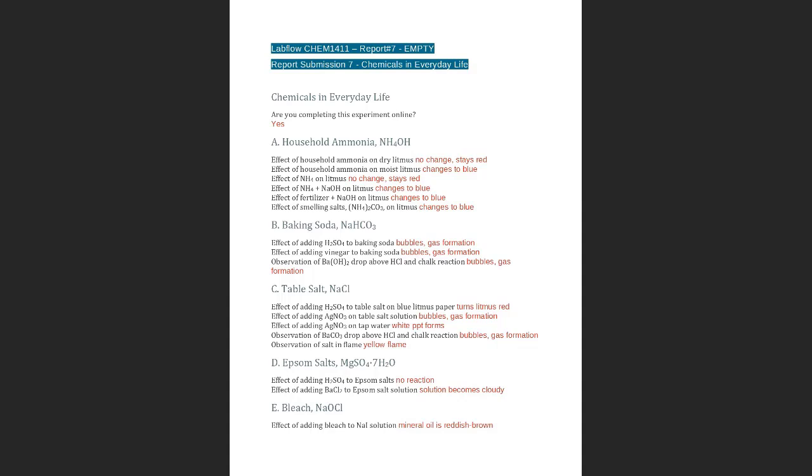When it's moist, then yes, it changes to blue. This is what we were just saying. So read that, because you will need to know what the effects of this reaction are. This is a nice summary. Unfortunately, you cannot observe what we just went through. These are the answers of what you are going to observe.